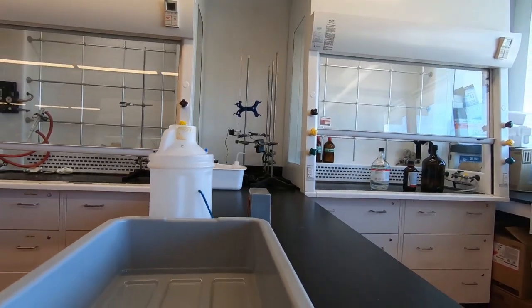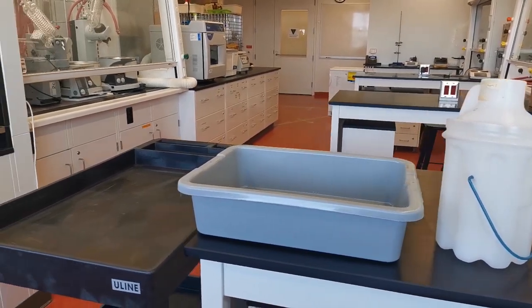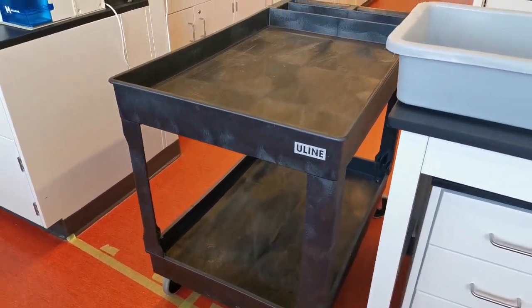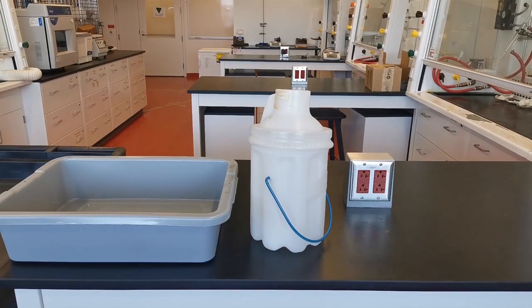Next, we need to ensure that we have appropriate means of transport. Secondary containment should always be used when transporting hazardous materials. If a single bottle needs to be transported, then a bottle carrier is the recommended type of secondary container. If transporting more than one hazardous material, then a cart with lipped surfaces or a tray should be used.